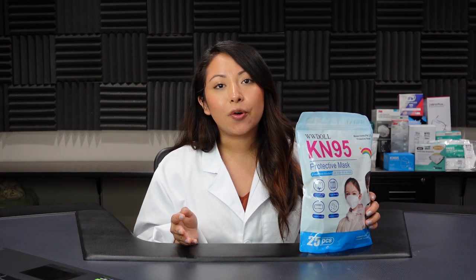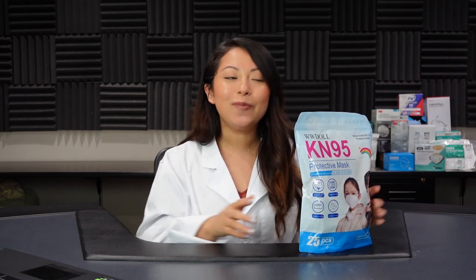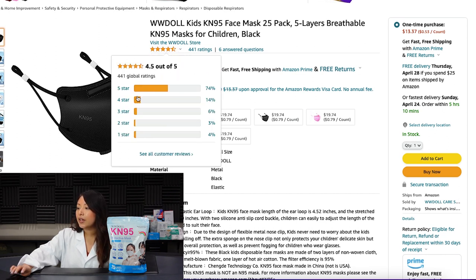We're also going to be testing KN95 respirators, so if you guys have any requests, please make sure to leave them down below. This is the WWDaw KN95 face mask, pack of 25. It's a 5-layer breathable KN95 mask for children, in the color black. They are being sold by the actual manufacturers and currently have a 4.5 out of 5 rating.